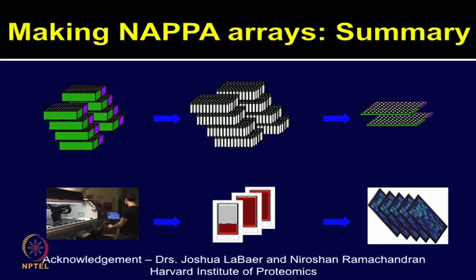The purified plasmids along with master mix can be used for spotting on the arrays. Now, these can be used on the microarrayers which can do the printing. Once printed, these slides can be stored at room temperature. Once you have performed all quality control checks, these arrays can be used for different types of biological applications.